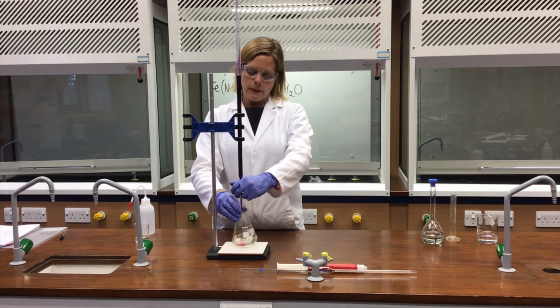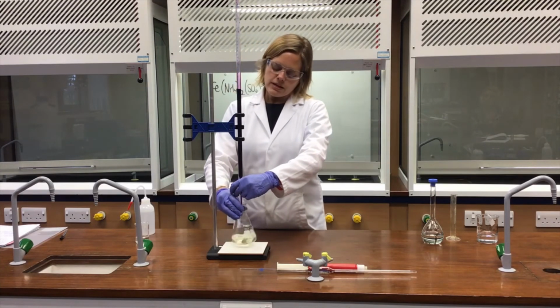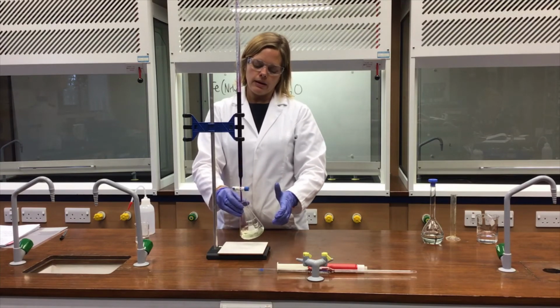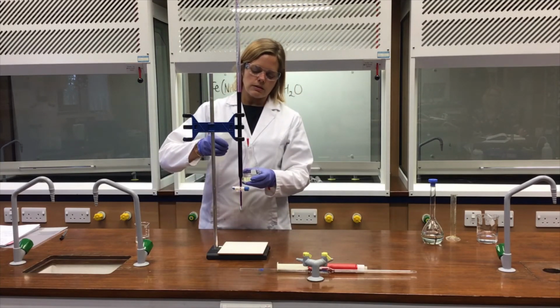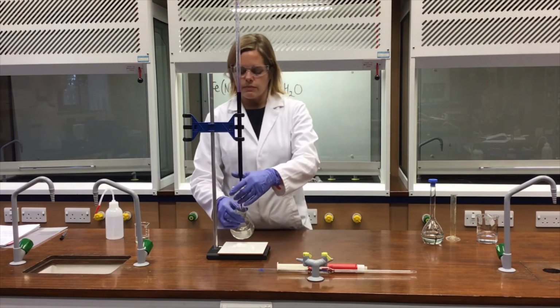Now that first permanent pink colour maybe takes a while to appear. It looks as if it's maybe getting a bit closer, so I might just turn that down a little bit so you can see it better. The reason that there's a first permanent pink colour is because one drop extra of this manganate solution will turn that solution pink. Now with the manganate being so colourful, you can see already that there's splashes of that at the side. So I'm going to actually rinse that down now so that those bits of manganate end up in the bottom of that flask.